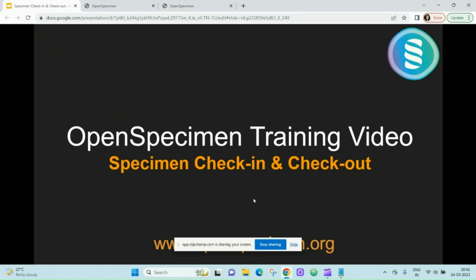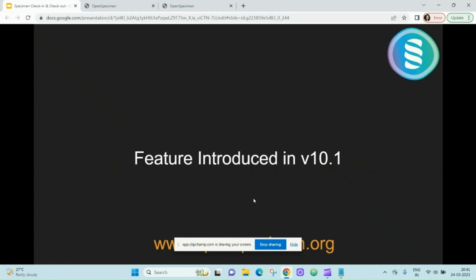Hello and welcome to the Open Specimen training session for specimen checkout, check-in and checkout. This feature is introduced in version 10.1 and onwards.